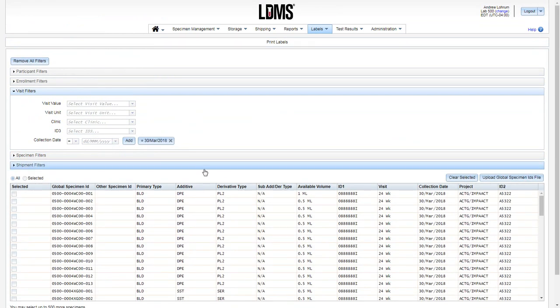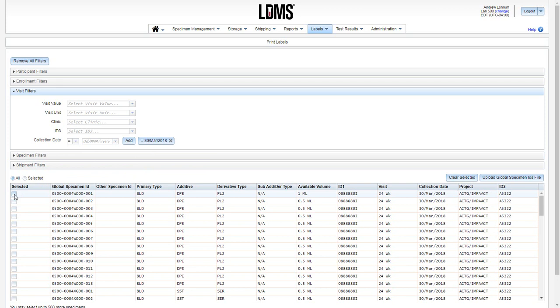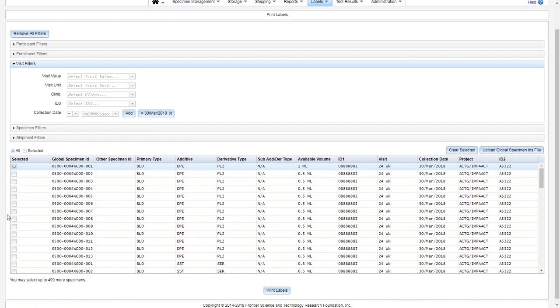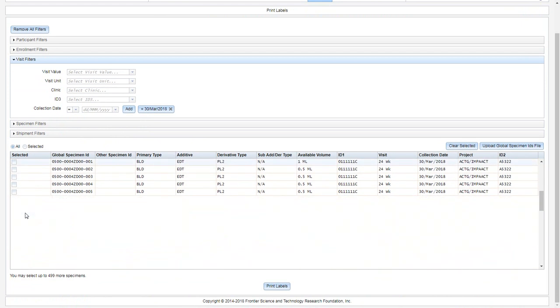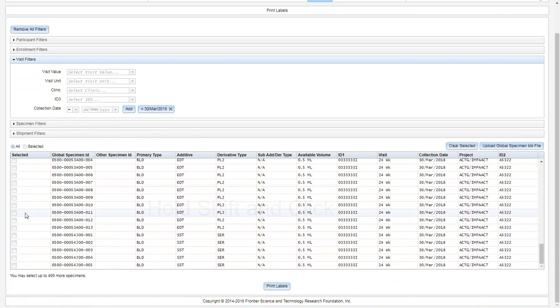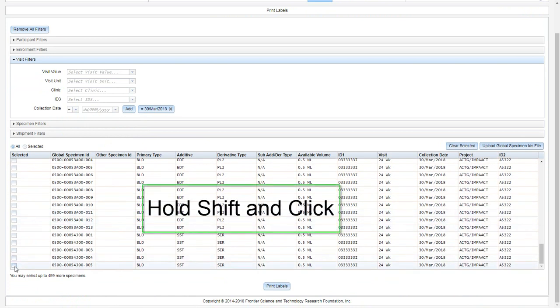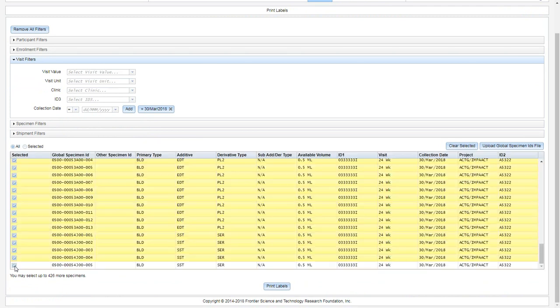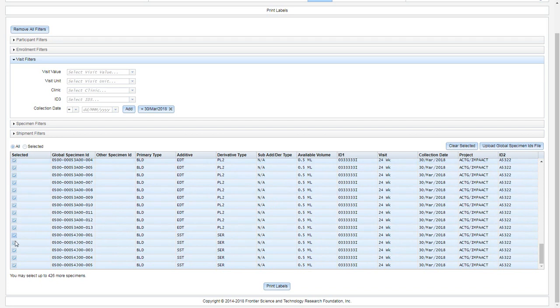This will show you all available specimens that were collected on that date. Click the checkbox to the left for the very first specimen and scroll down to the end of the list. Hold down the shift key. With that shift key held, click the last checkbox in the list and all the specimens in the list will be highlighted.